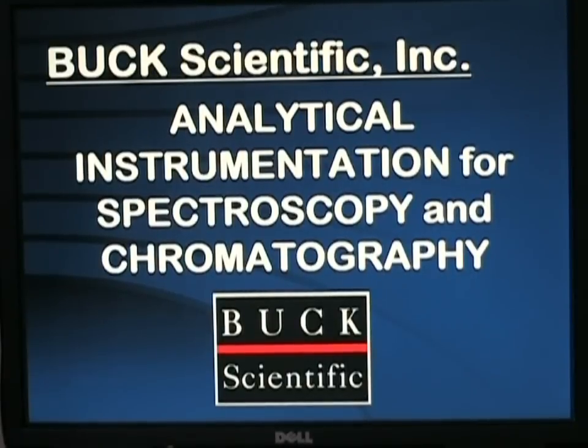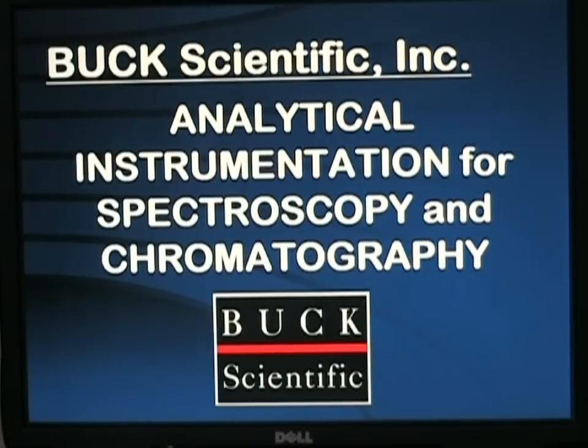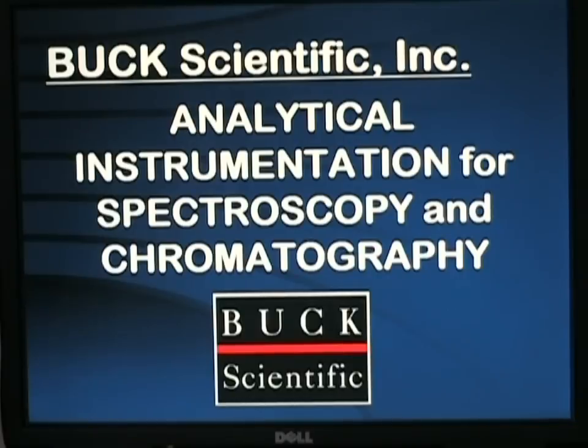This is the installation and basic operations training video for the Buck Scientific Model 310 Air GC, specifically designed for undergraduate teaching and academic experiments.